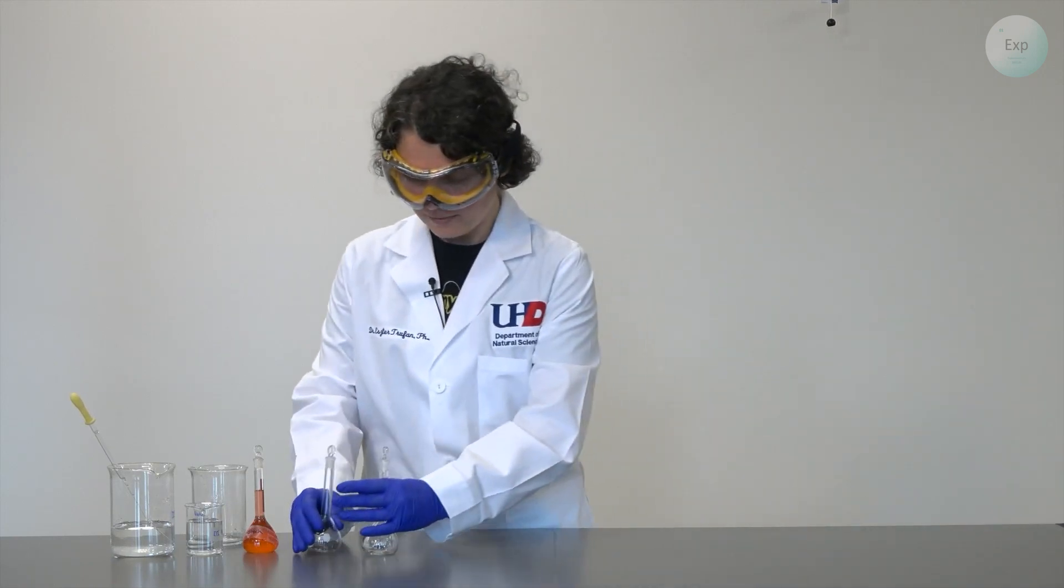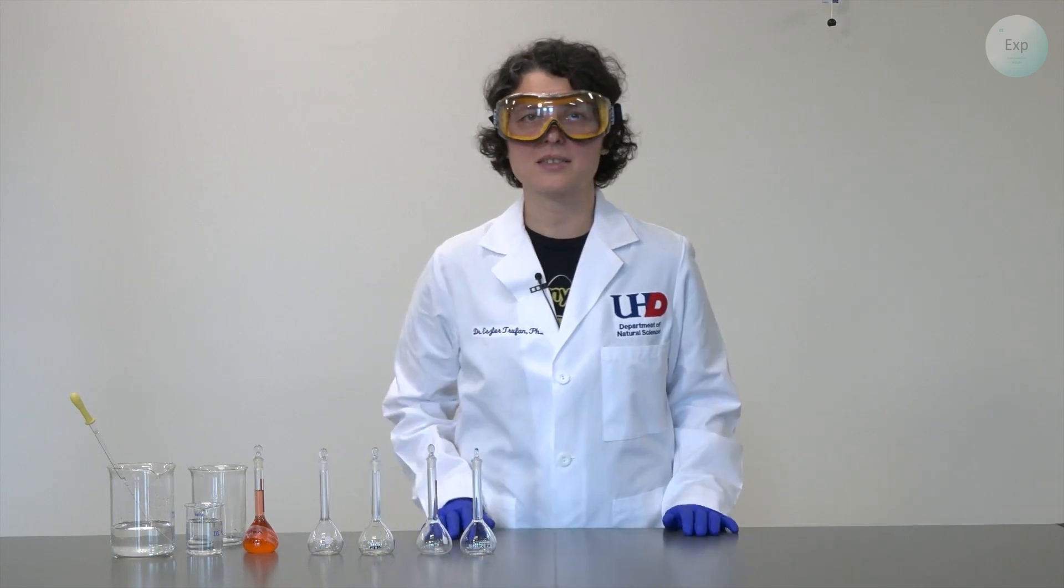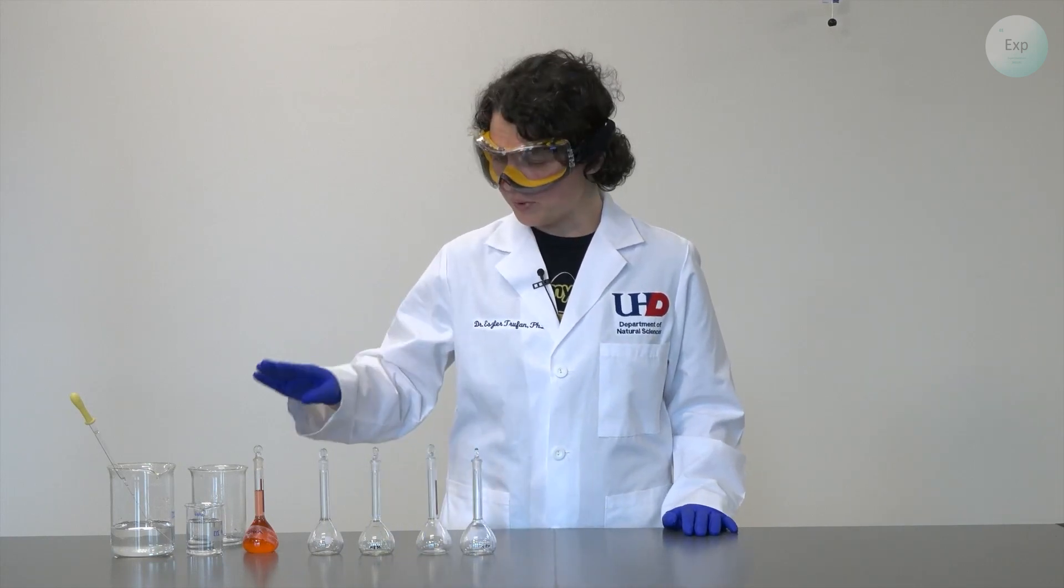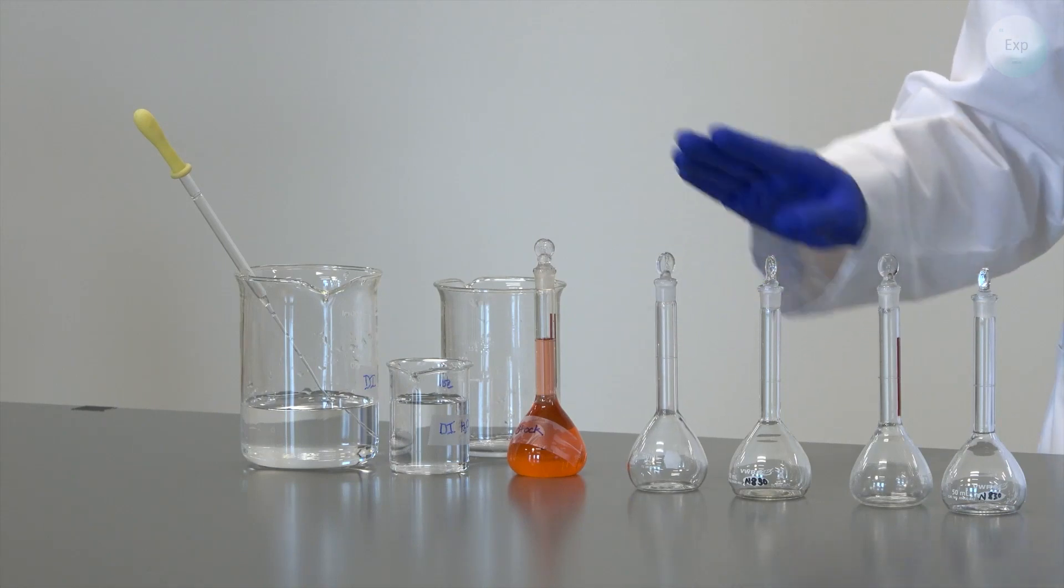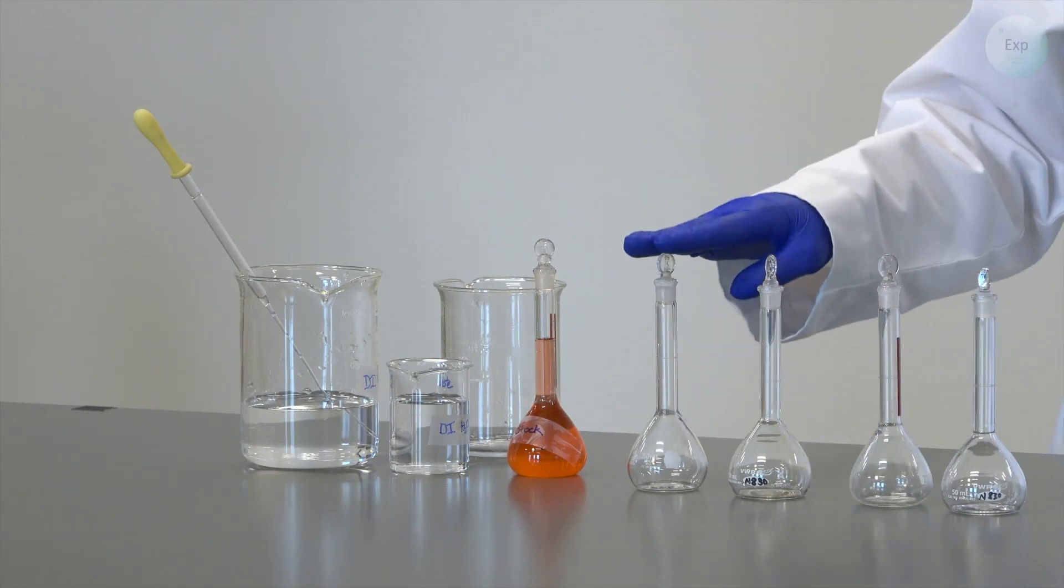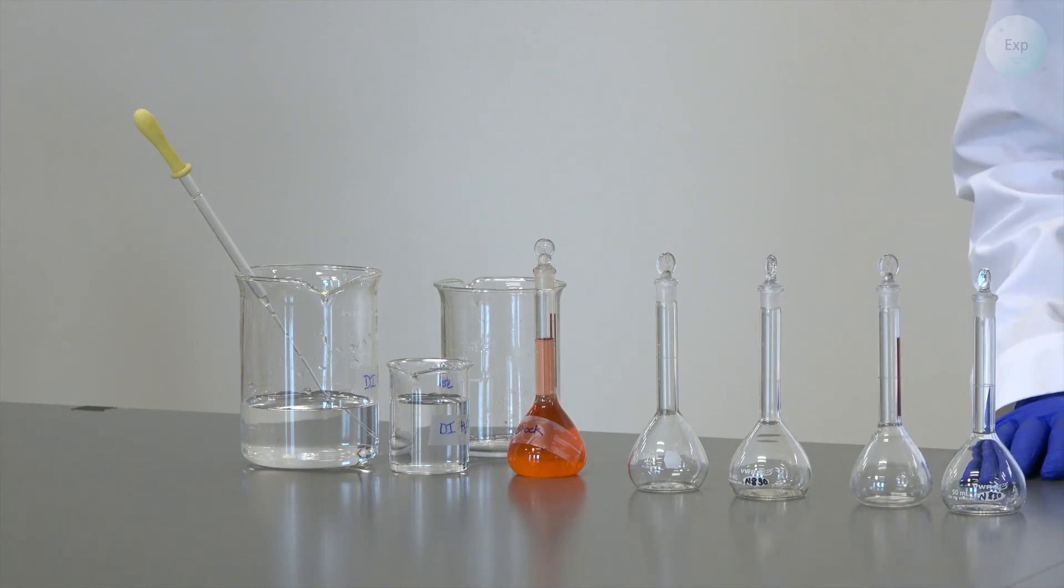I will perform four dilutions in a process that we refer to as a serial dilution, which means I will be using the same amount of my solution, pour it into the next volumetric flask, fill it up to the marking, homogenize it, and use the same amount over and over again as we perform the serial dilution steps.